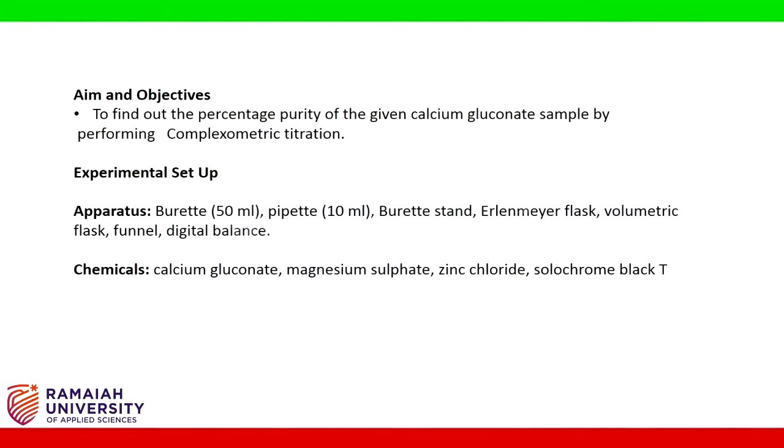Apparatus required for this experiment are burette, pipette, burette stand, volumetric flask, funnel and digital balance. Chemicals required are calcium gluconate, magnesium sulfate, zinc chloride, solochrome black T.